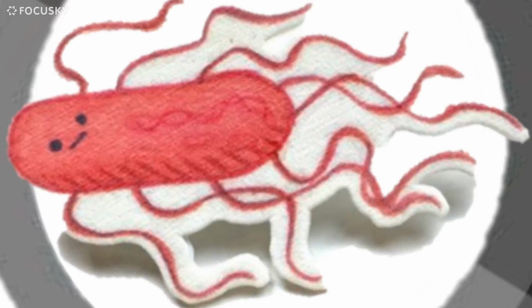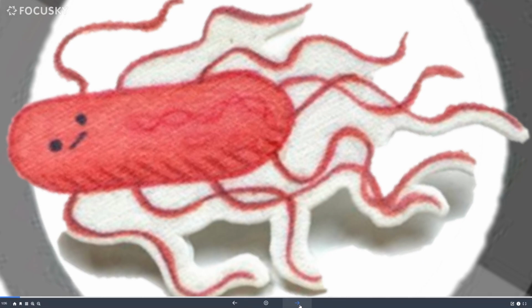In this video, we will learn the principle of media you have used and what the positive reactions should look like. Perhaps this is the most challenging lesson for the Salmonella module.